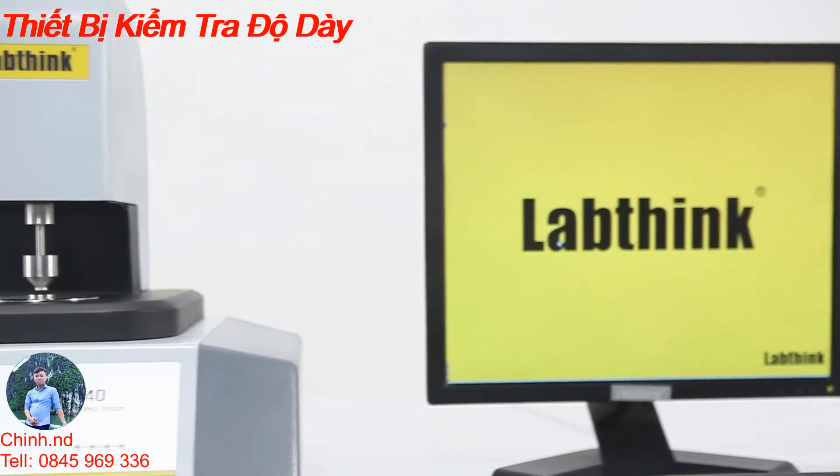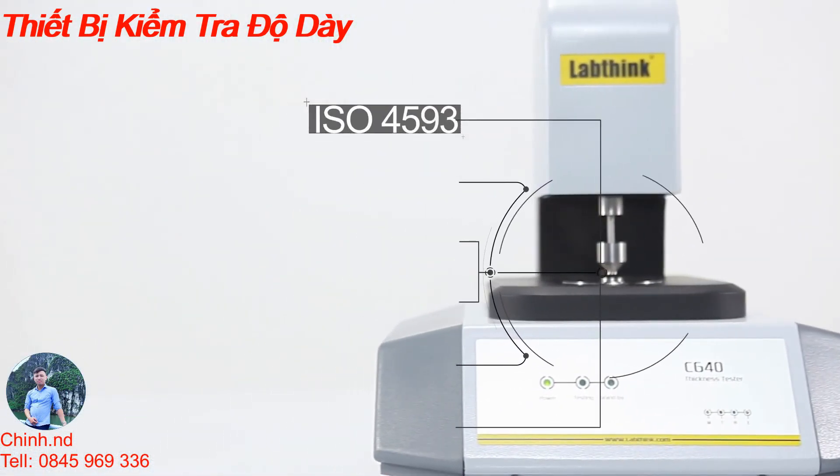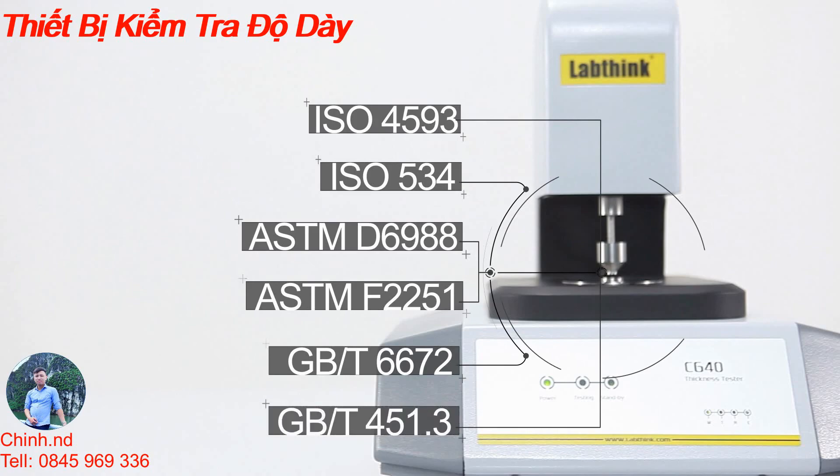The C640 thickness tester conforms to multiple Chinese and international standards, including ISO 4593, ISO 534, ASTM D6988, ASTM F2251, GB/T 6672, and GB/T 451.3.